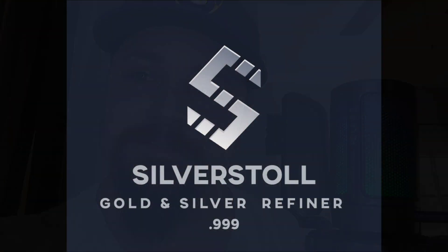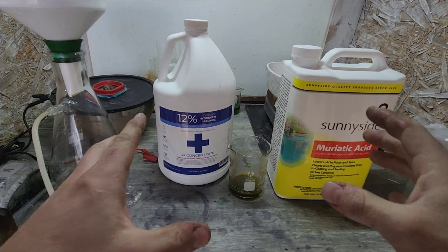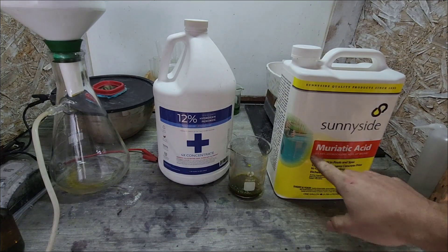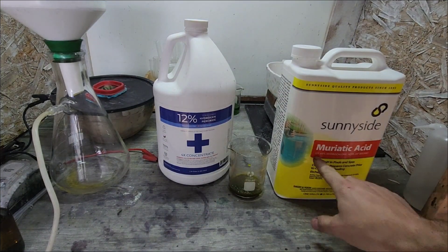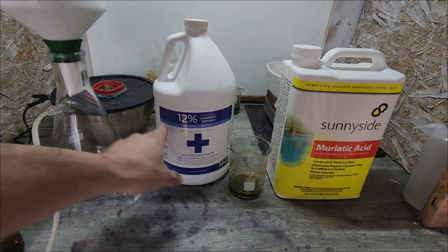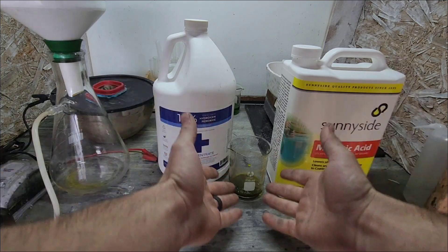Dissolving gold with hydrogen peroxide. For this project, all we're going to need is some hydrochloric acid or muriatic acid — the same thing. We've got 31%, and hydrogen peroxide, 12%, and of course, gold.